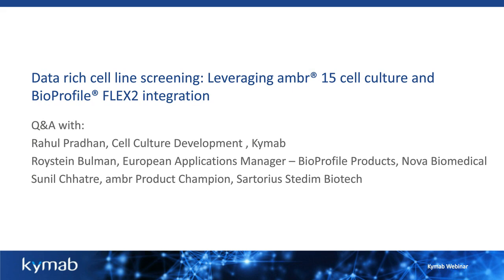Okay, thank you. A question about glucose feed. Were you only feeding the glucose, or were there any other parameters? Yeah, this was a fed batch process, so there were various other feeds that go into the process on top of glucose. Sure, understandably. Did you factor in the volume changes in ambr compared to manufacturing bioreactors for the study? So we run all of our ambrs as scaled-down models of a larger system, so yes, that was factored in. Okay, thank you.